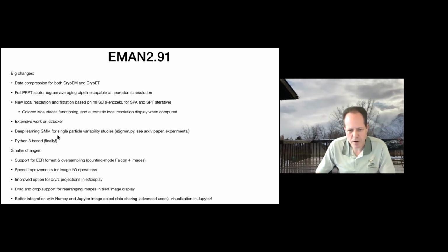This I'm also going to talk about today: the deep learning Gaussian mixture model for single particle variability studies. This is only for single particle analysis right now, but one of the things we're working on is extending this to subtomogram averaging as well.